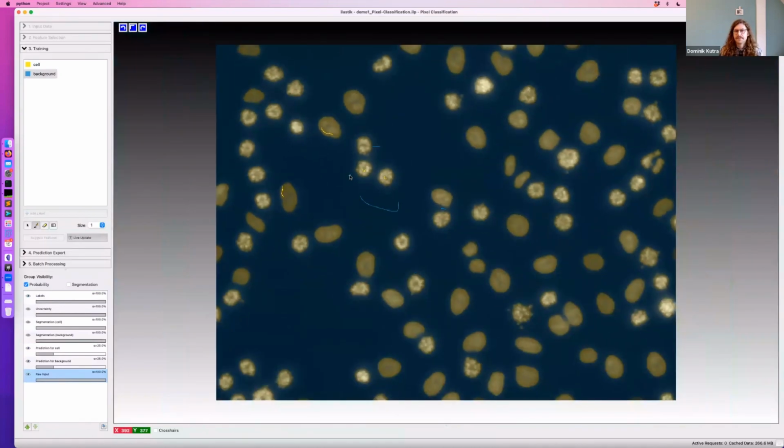And you can do this basically on images of any kind. So they can be 2D, 3D with multiple channels, and also time series. And of course, you are not limited to two different labels or to a single image. You can train a joint classifier with multiple images and train something that generalizes well over new images as well. Then in the end.